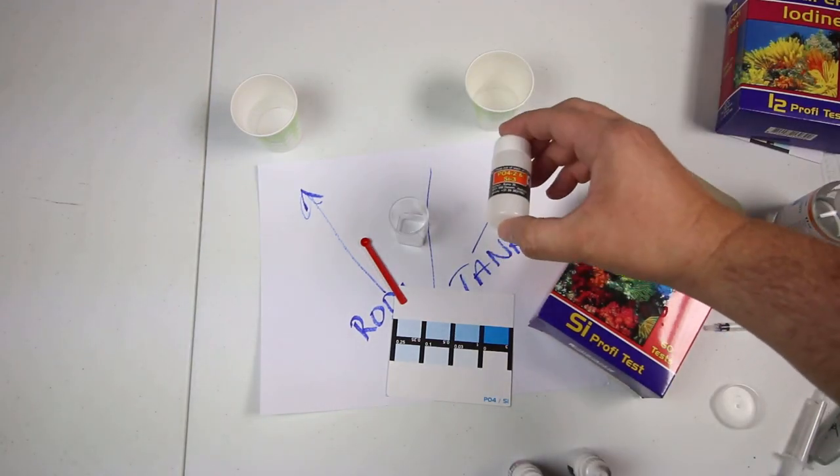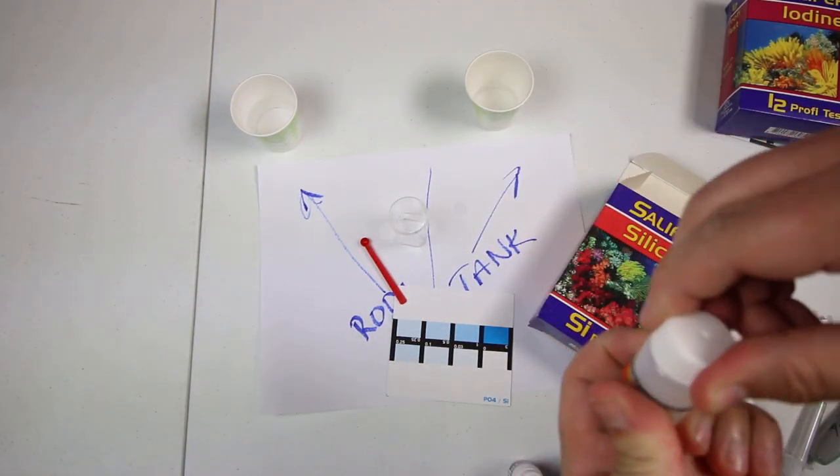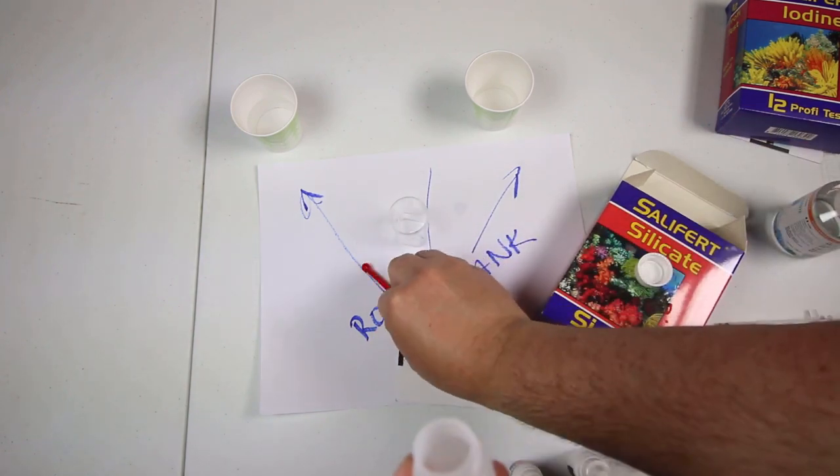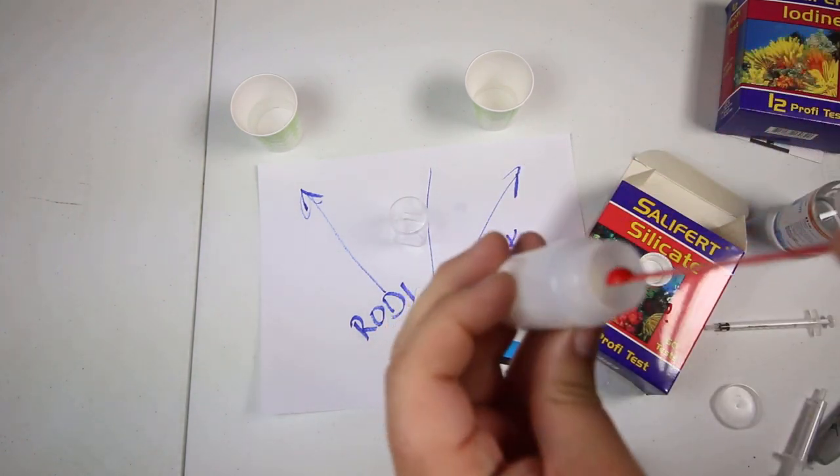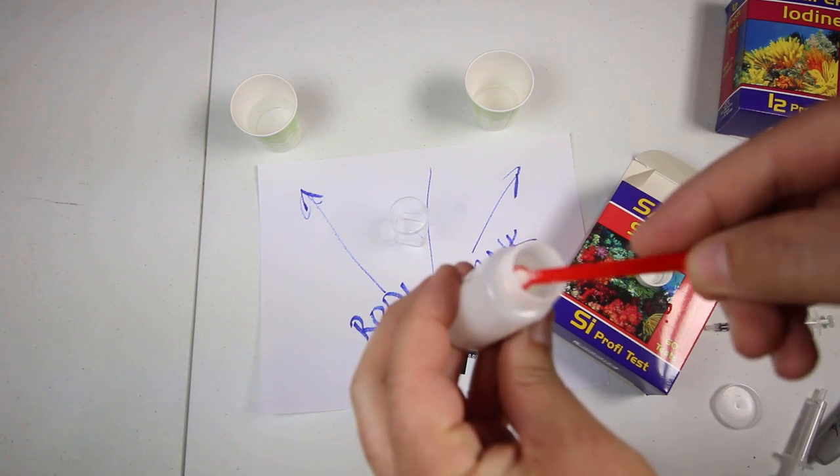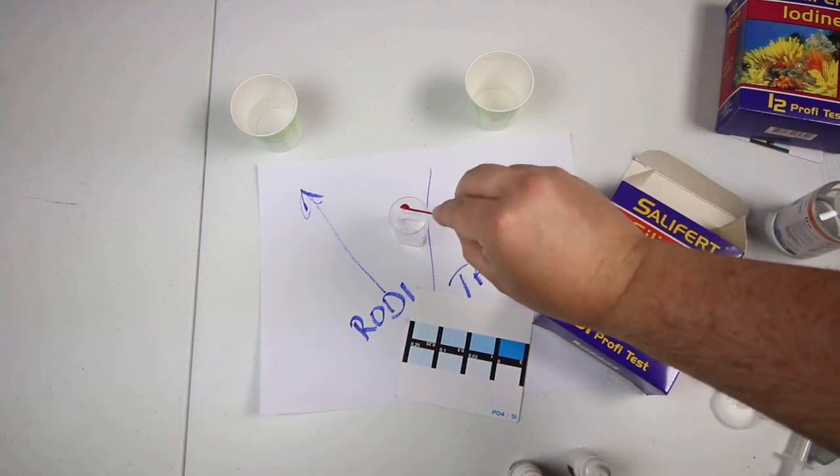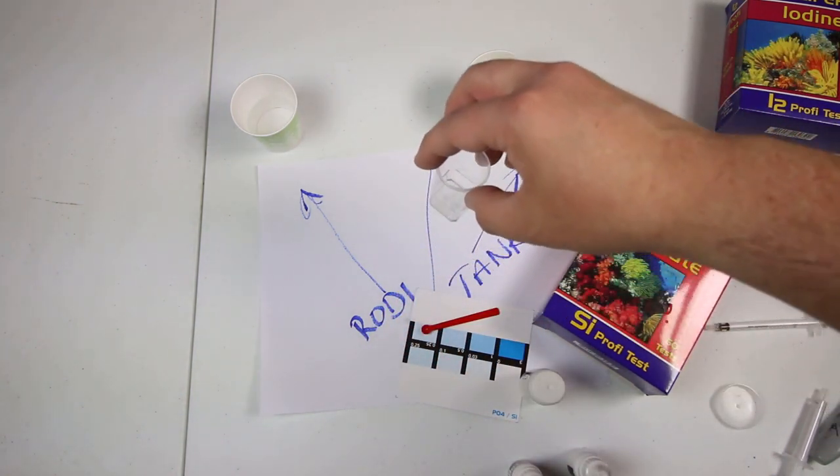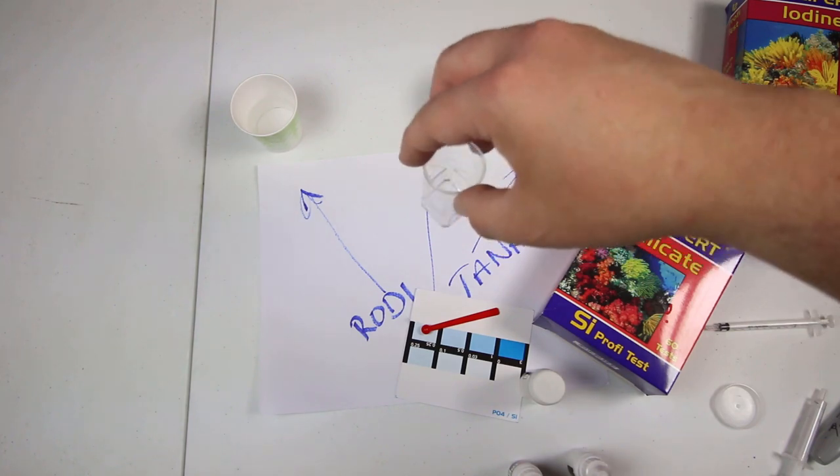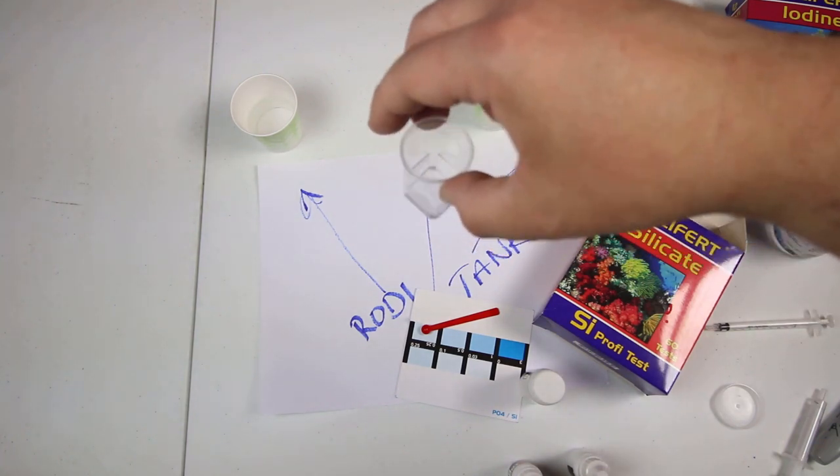And then last but not least we are going to take the SI3 and this time this is a dry powder. We're going to add one level scoop into our mixture and then we're going to swirl this again gently for 20 seconds and our test will be complete.